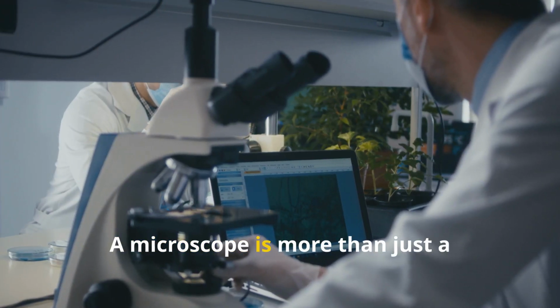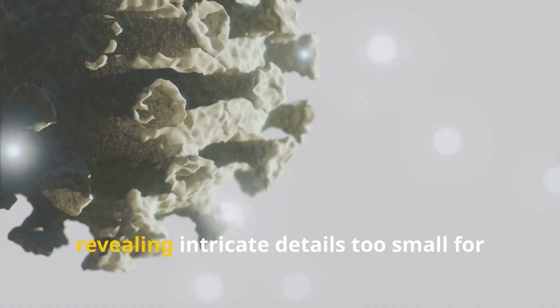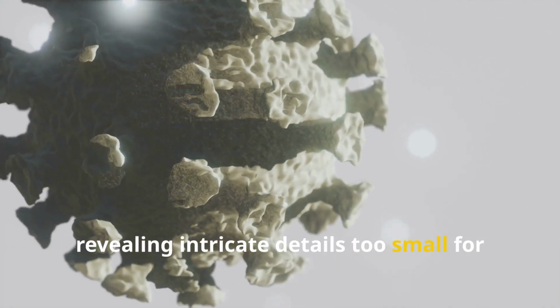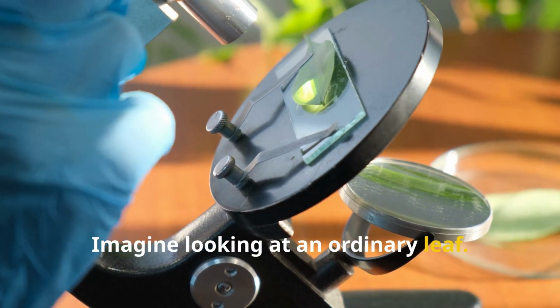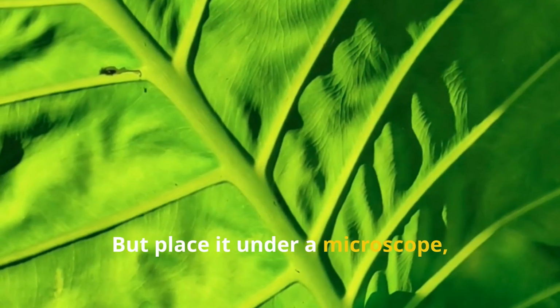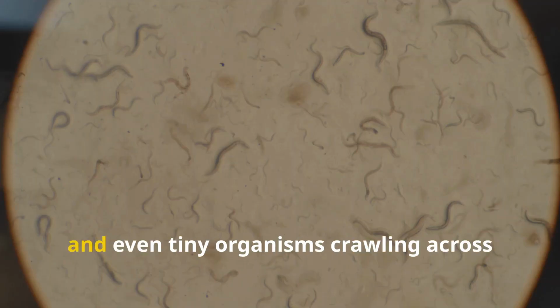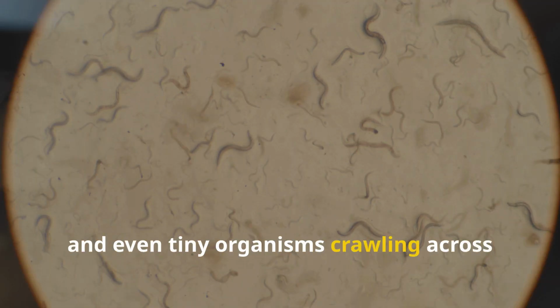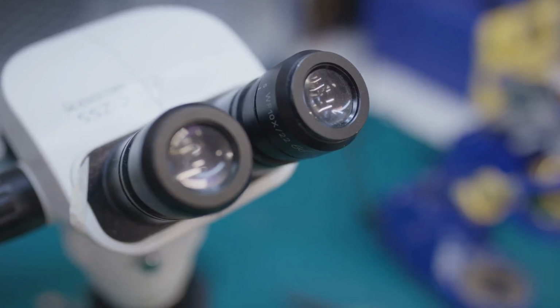A microscope is more than just a tool. It's a gateway into an entirely different universe, revealing intricate details too small for the human eye to detect. Imagine looking at an ordinary leaf. To the naked eye, it's just green and smooth. But place it under a microscope and suddenly you see an intricate network of veins, delicate cell walls, and even tiny organisms crawling across the surface. This is the power of magnification.